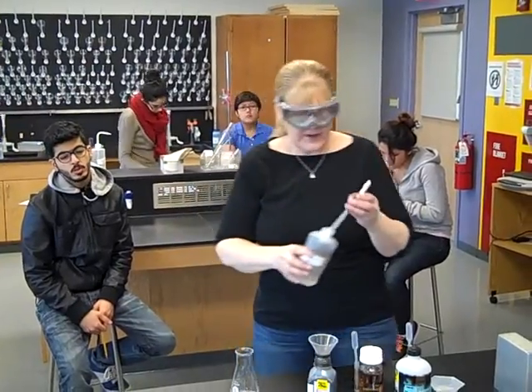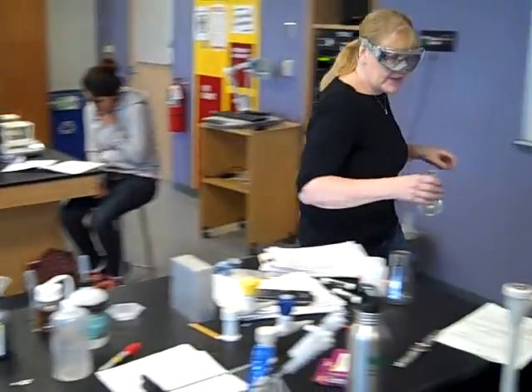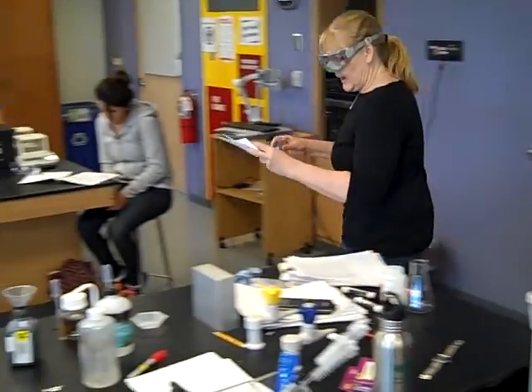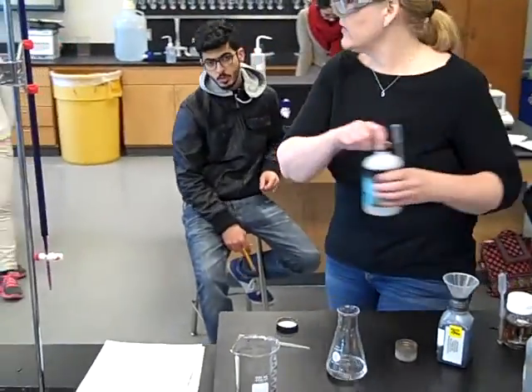You can use a graduated cylinder if you need to, but honestly just add some water — it just needs to dissolve. Then we need to add some sulfuric and some phosphoric acids. The amounts are in the procedure, and it says we are going to add about 50 mils of water. We need three mils of the sulfuric.